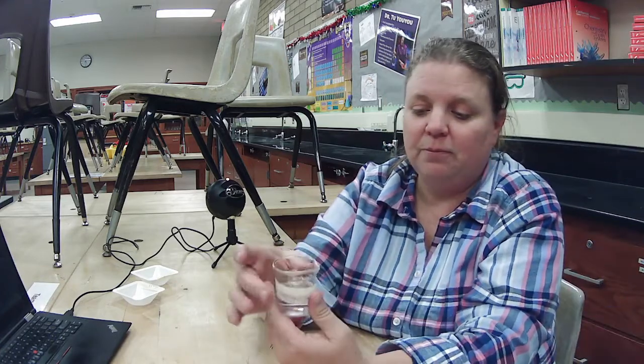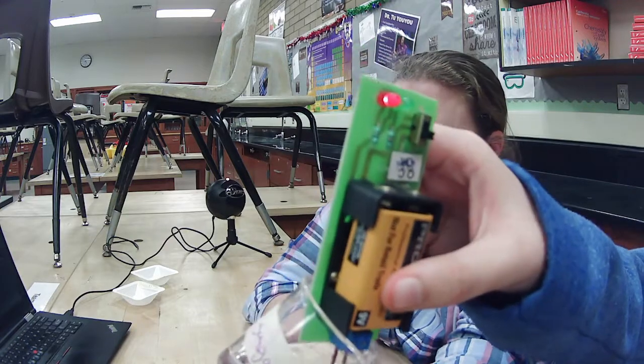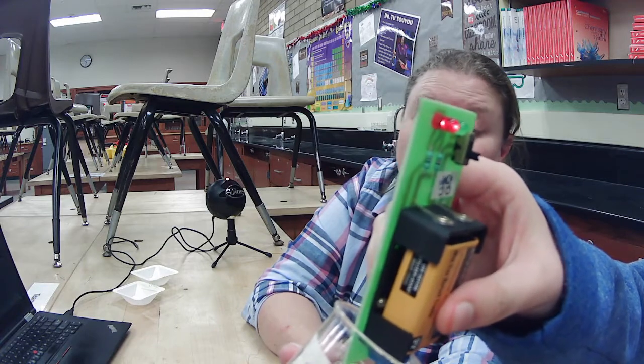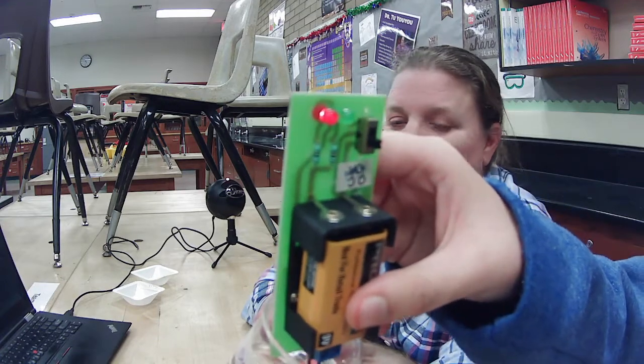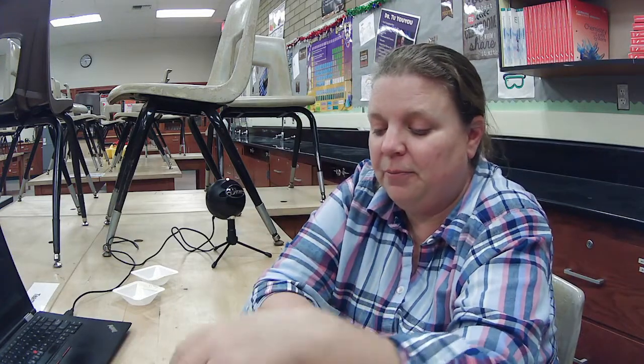Next is going to be sugar water, and then last we'll do salt water. Sugar water is dissolved covalent bonds in water, so let's see what conductivity that has. Remember, our distilled water has a very low conductivity. Again, it's very dim, and that's because sugar dissolved doesn't make ions, so it doesn't have anything to conduct electricity. What is conducting electricity is those ions that are still in the distilled water. You're going to rinse it one more time.